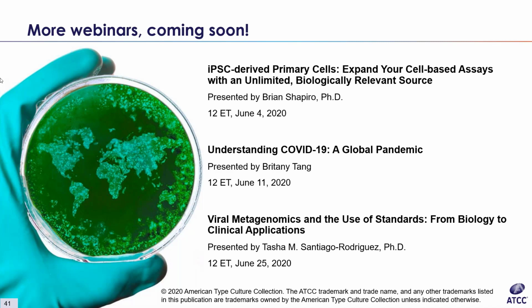Do we have a protocol for checking expression of Cas9 when people are using the new HEK293 Cas9-expressing cells?